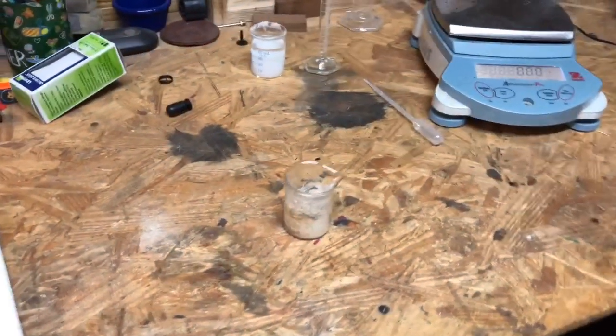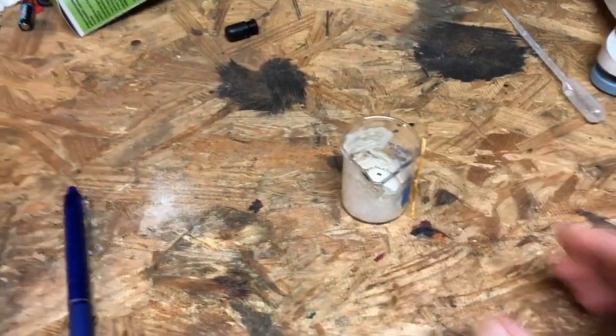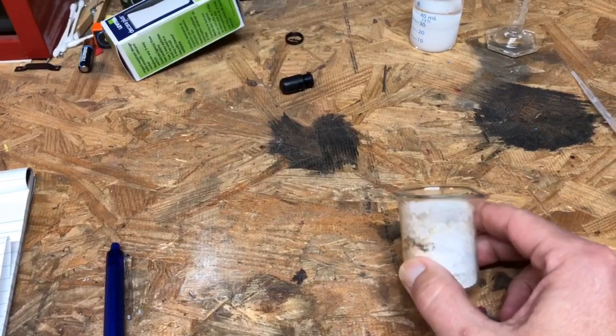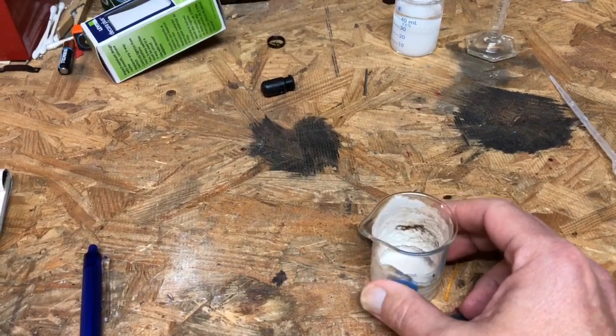All right, we are back. We have taken that 10 milliliters and let it boil down. And so we take a look inside. We see all the salt that has shown up here. We got a little bit of splatter. Looks like it kind of crawled up to the side, so it's a possibility that we lost a bit.